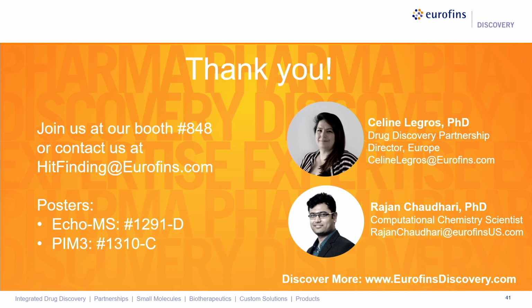Yeah, in the activity-based assay, we actually screened the small molecule and the fragment library in ADP-Glo at the same time. So that was easy, just several extra plates. And what is great is to get all the assays set up at the beginning of the project. I have in mind the biophysics. If you have it nearly ready at the beginning of the conventional HTS, you can keep your chemists under control and release the data for fragment and small molecule nearly at the same time. So if you have all tools ready at the beginning, you can manage their expectations and get them to wait, even if it's difficult.